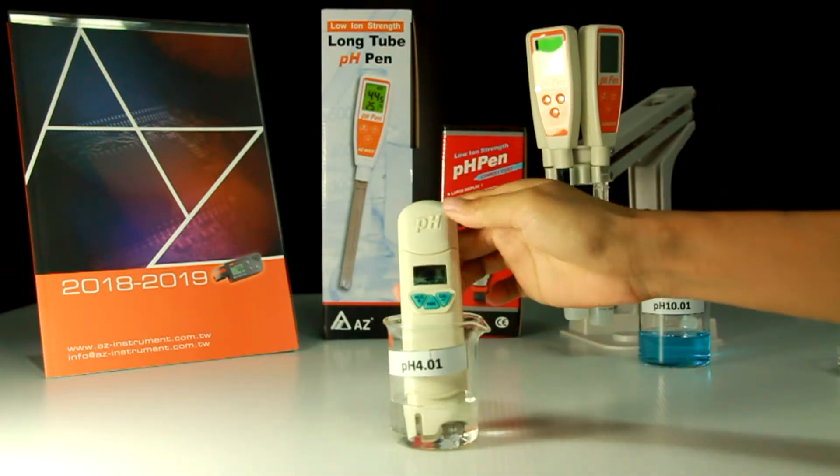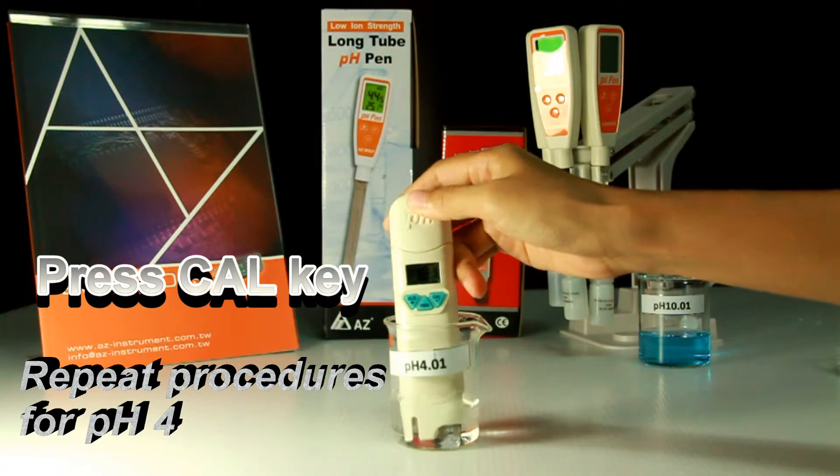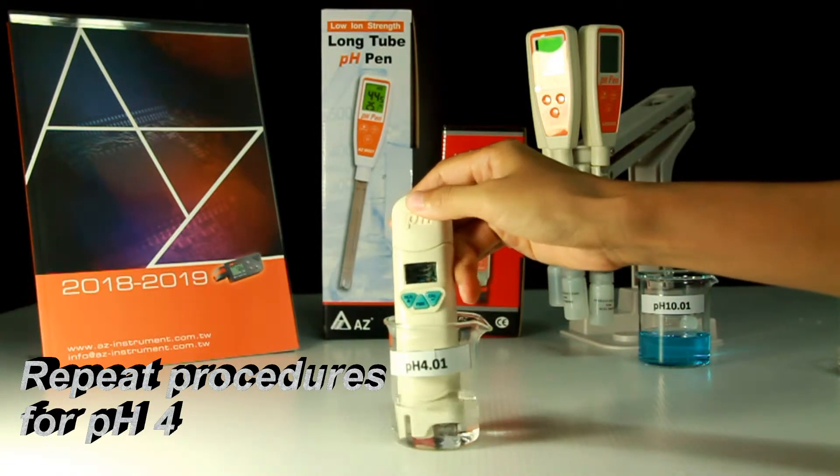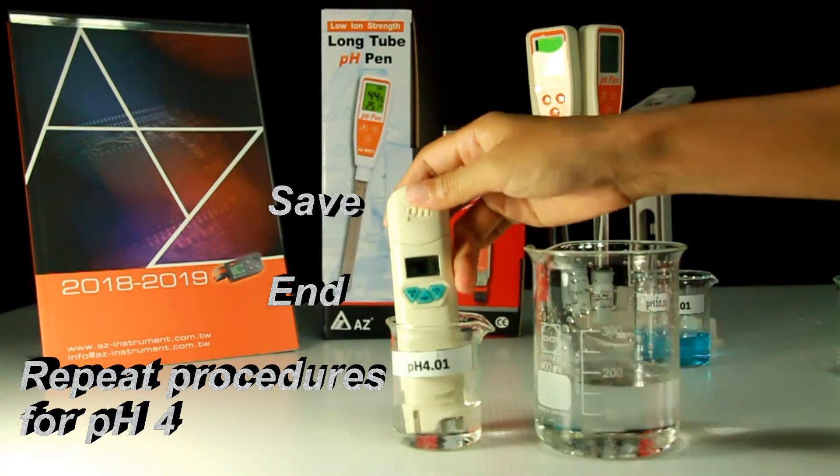Then immerse the electrode into the next calibration buffer. Repeat the above steps: press the calibration key again when the PH Pen reading is stable in the new buffer. Stir gently until the reading is stable and you will see the save icon and end icon appear on the display.